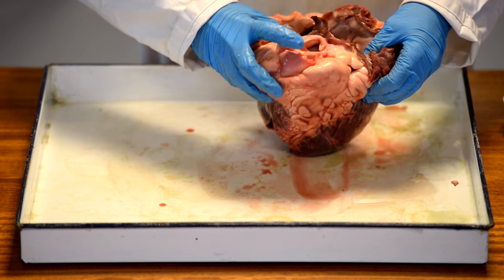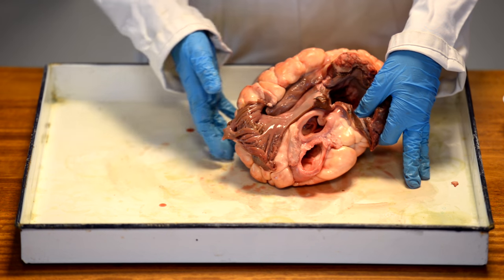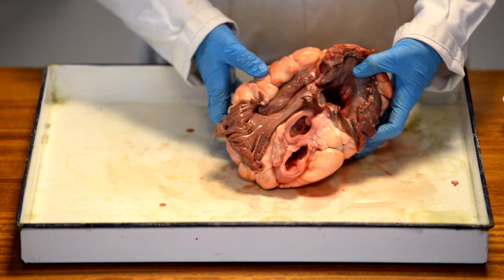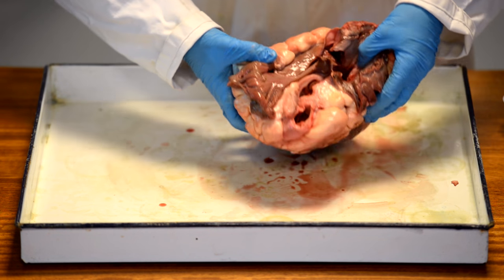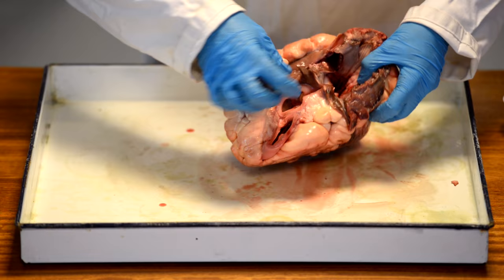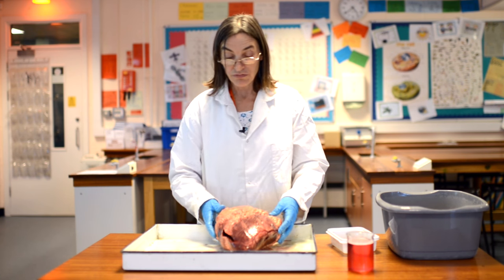And it's easy to identify which is the pulmonary artery here, because the blood is only going to the lungs. It's not under hugely high pressure. It's the thinner of these two blood vessels, with thinner walls. It then returns into the left-hand side, into the left atria, and down into the left ventricle, and out from there via the aorta, the massive, massive artery, the major artery. So I think we need to look inside to see the route that it follows.